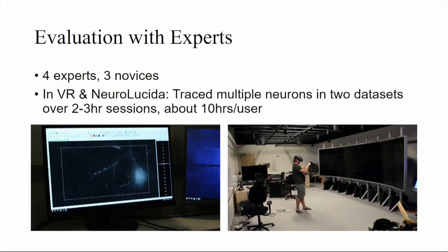We found that people would consistently go through and work the 2 to 3 hours and felt comfortable being in the environment for a long period of time, which I think is an important testament to being able to provide an immersive tool that people can actually use in the lab. So here we have a picture on the left of the desktop software, and on the right of one of our co-authors tracing some neuron data in the lab.